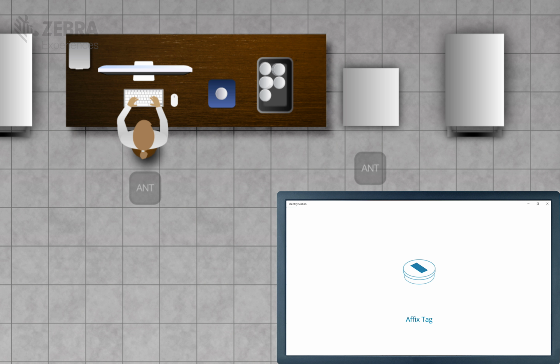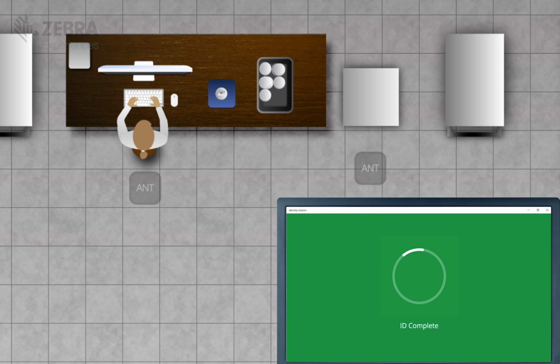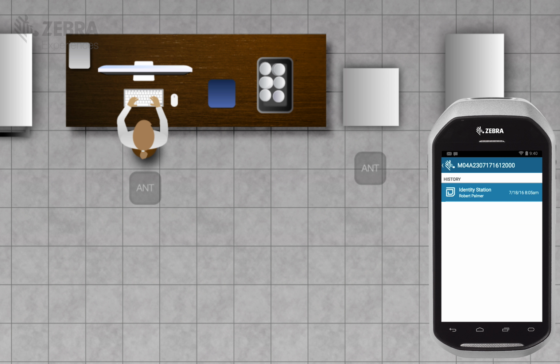The culture, which is on the scanning pad, now receives its printed RFID tag. The system scans the tag and validates the process is complete, and the operator moves the culture to an awaiting tray and repeats the process with the next culture.